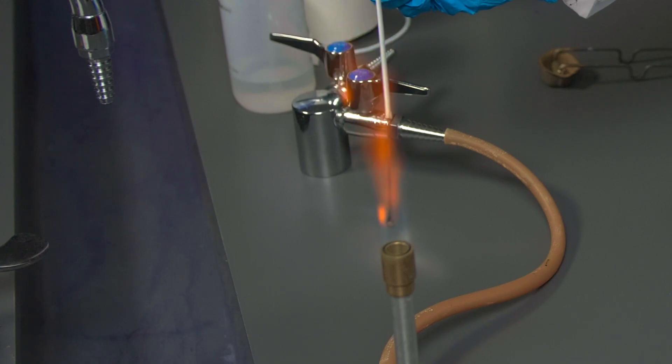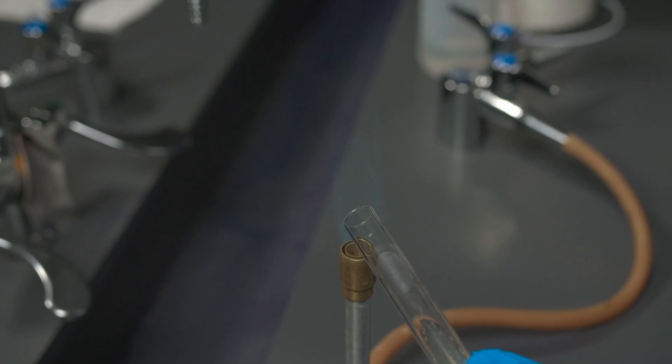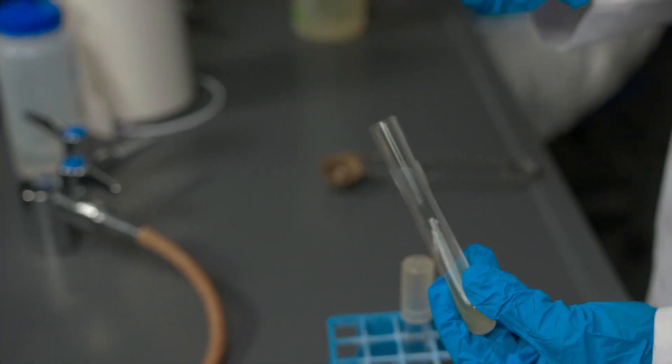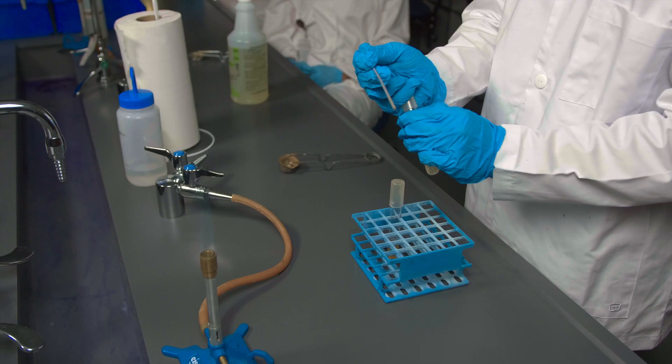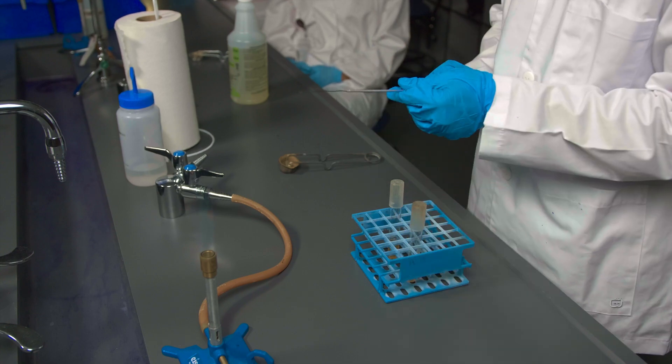Once done, remove the loop and flame it thoroughly. Also, flame the rim of the slant. Then, place the cap back on the slant and put it back in the test tube rack.